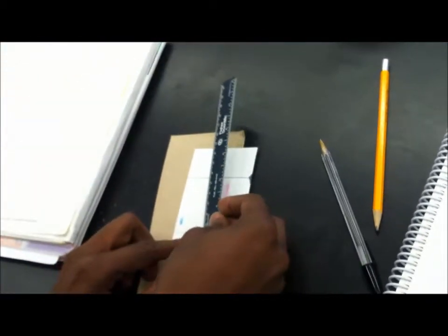All right, now we're going to measure this dark green dot here. And we're going to measure from the bottom. If I can get the ruler, I'm going to measure from the bottom to it and it's the strongest point right there. So, and as you can see, it is about 5.6. So we're going to say 5.6 for that one.